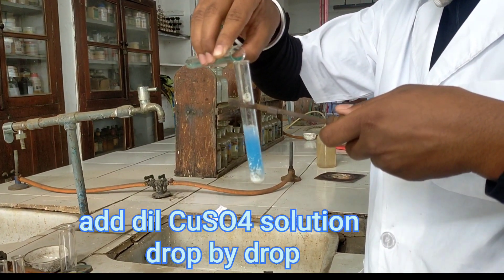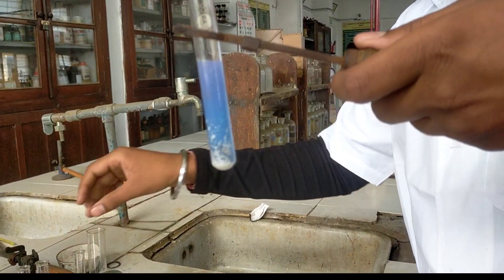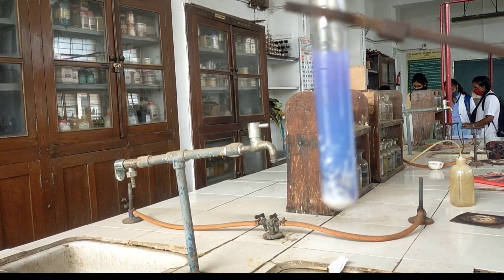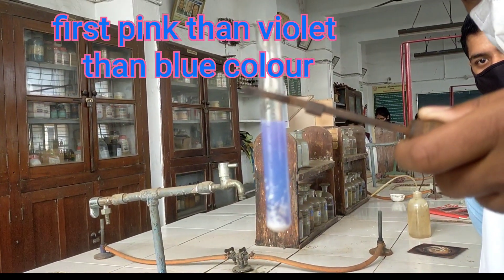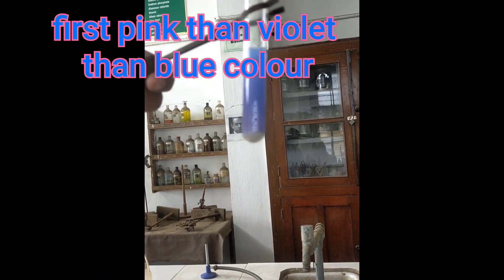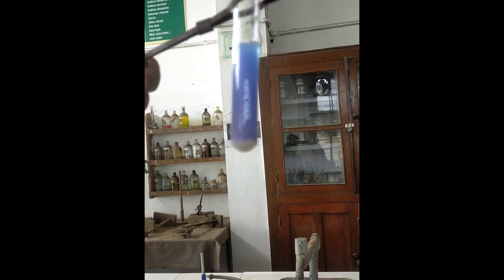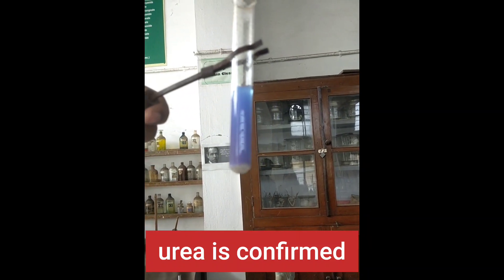Chemistry is really beautiful. Here we can deeply observe that a combination of pink, violet, and then blue colour is formed. This beautiful test confirms the presence of urea in our compound. We see a beautiful combination of three colours: blue, followed by violet, and then pink. This test confirms the presence of urea in our compound.